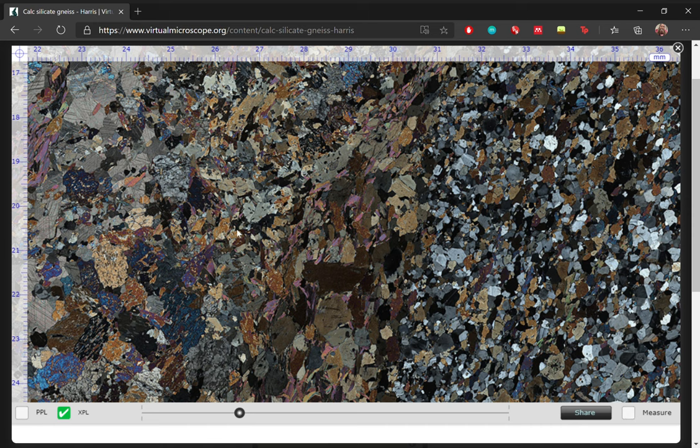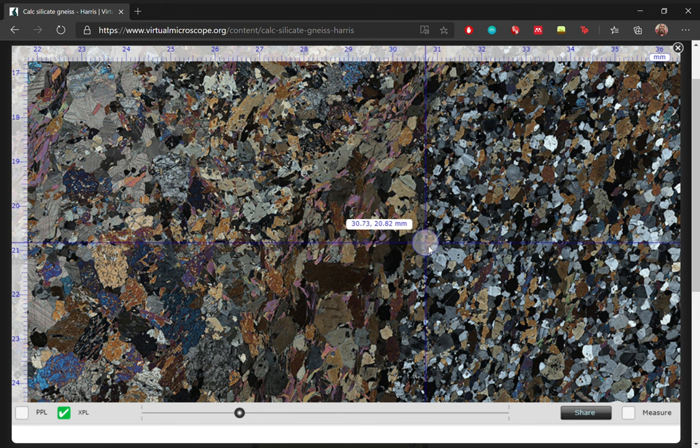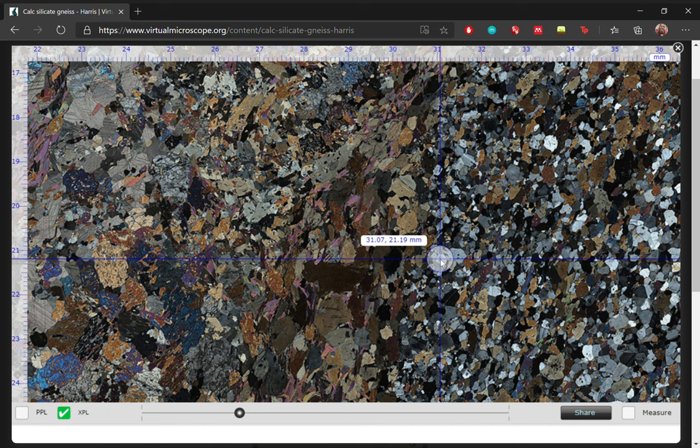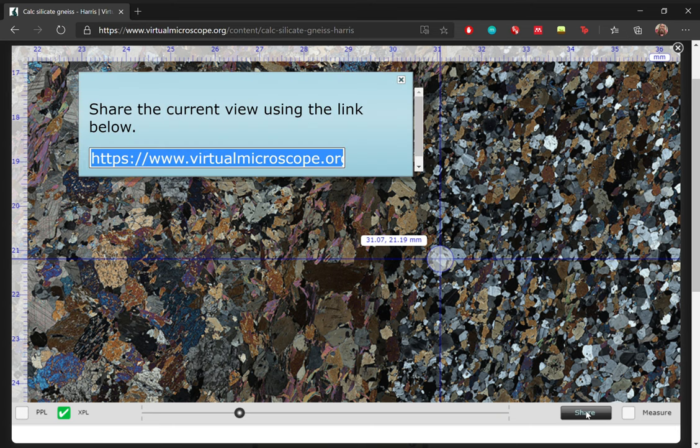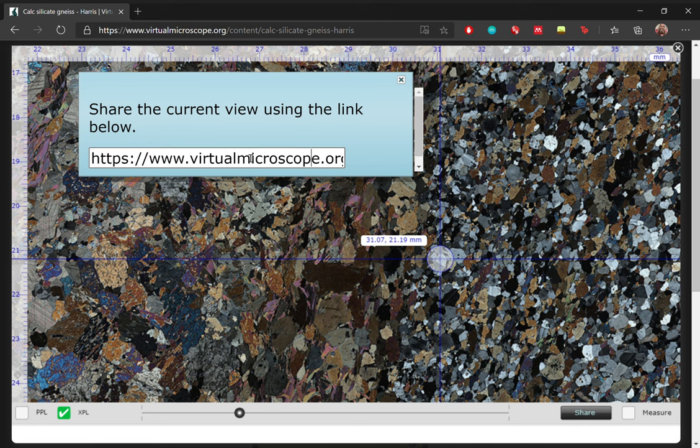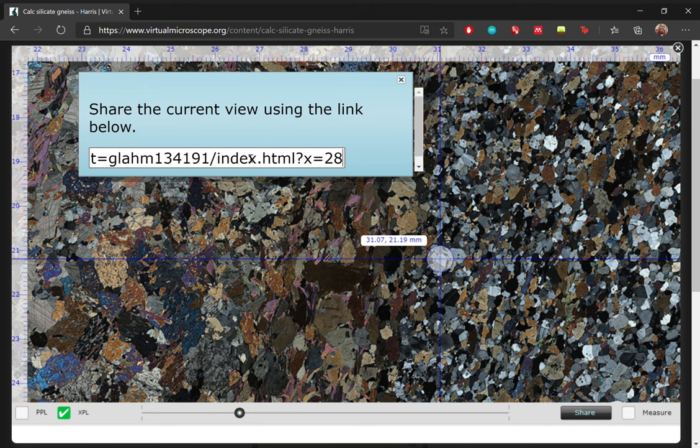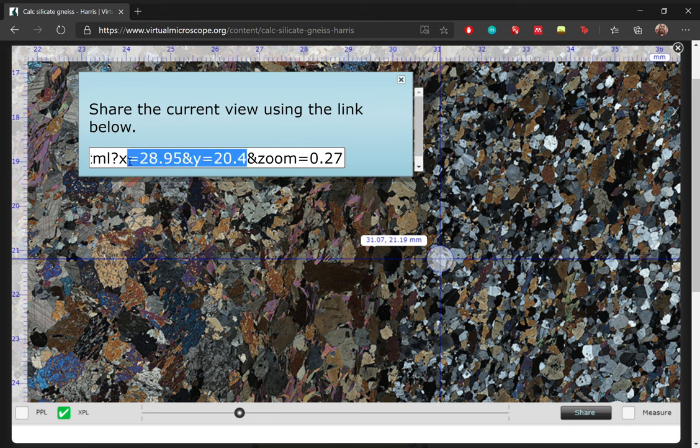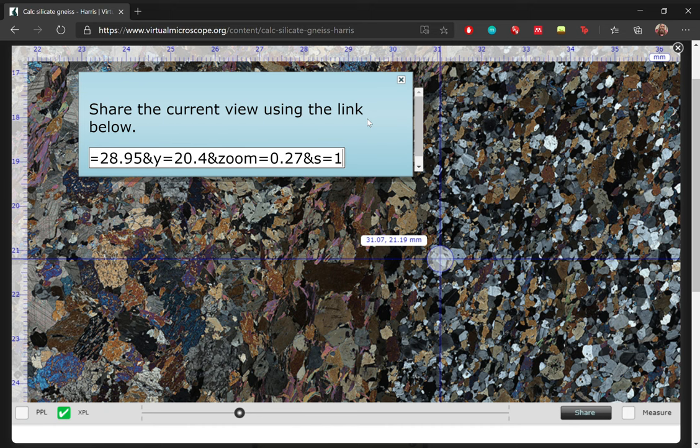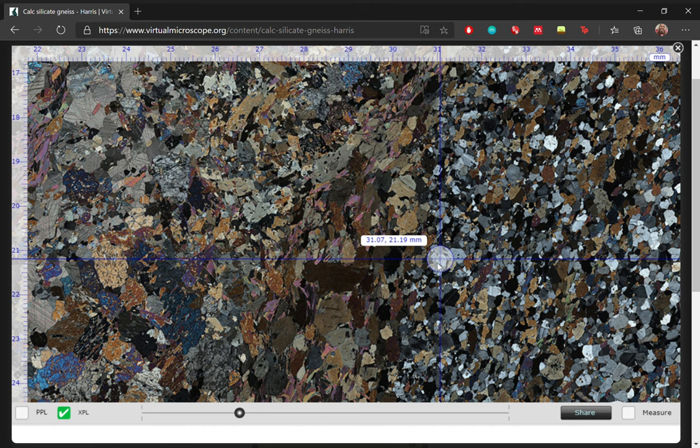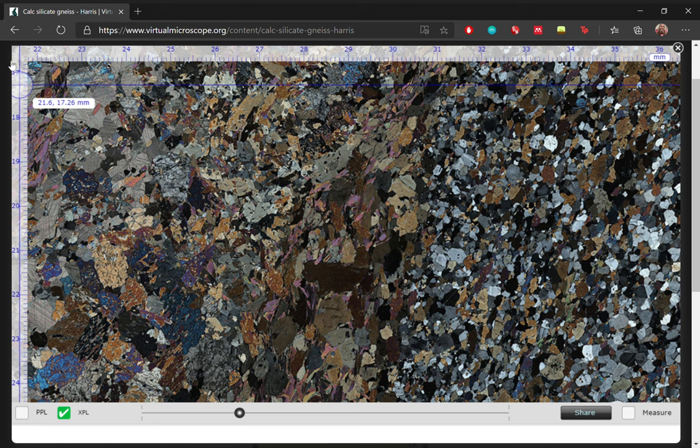And another useful tool in this particular view would be the crosshairs. So if you have a feature of interest, let's say you're interested in this very specific quartz, specifically here, then you would drag the cursor down, drag the crosshairs, and it will let you know where specifically this piece of quartz is. And if you would like to share this particular view, just click on share and it will give you a link to share it with. So if you zoom a bit further down, you will see that the coordinates have been embedded in this link as well as the zoom level. So you won't have to send the link and then tell somebody to go to exactly 31.07 and 21.19 millimeters because it's already embedded in the share link.